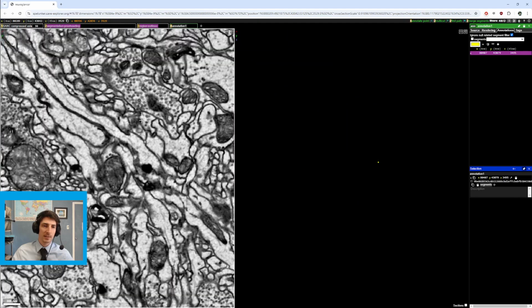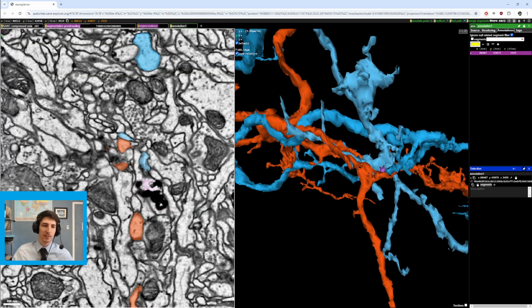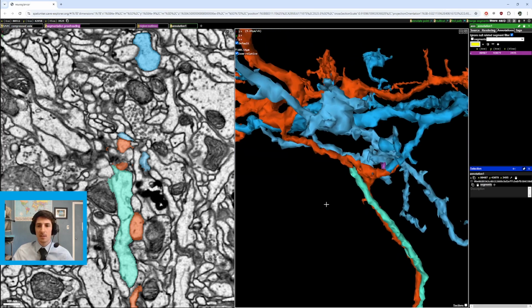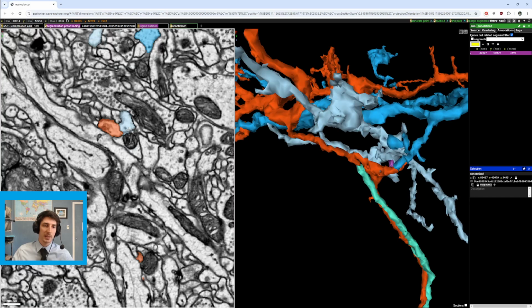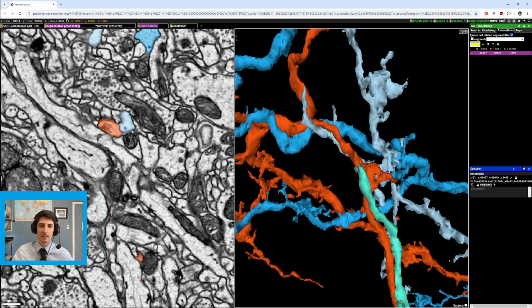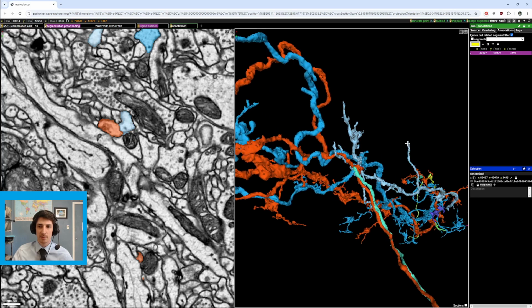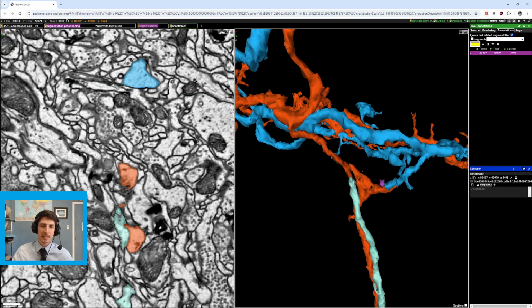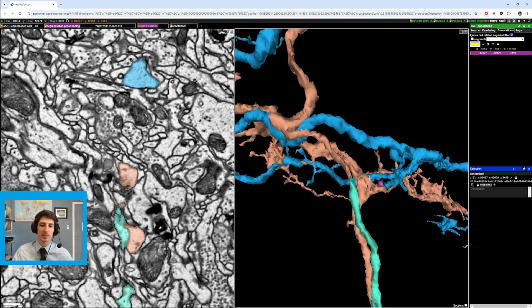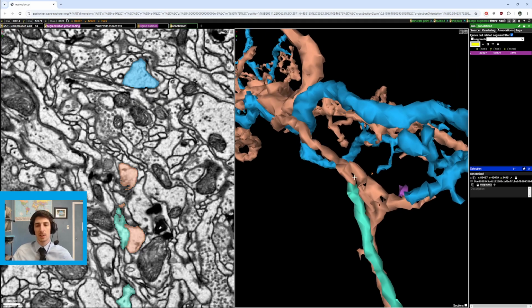All right. Yeah, just double checking there. And let's see if we can find the soma again. There we go. So it looks like this blue piece is part of this connection here, but it's likely only that and not this extra bit, which probably connects here or there or down there somewhere. So that is a smaller branch. We probably wouldn't need to connect it, but we would want to fix this because having a cell going to the incorrect soma is obviously no good.